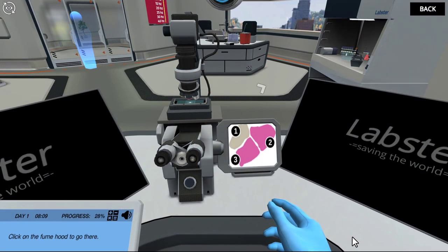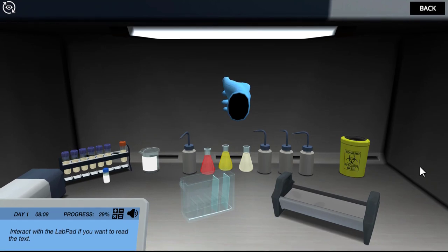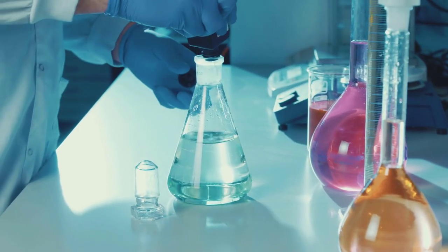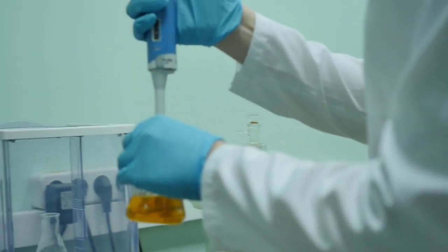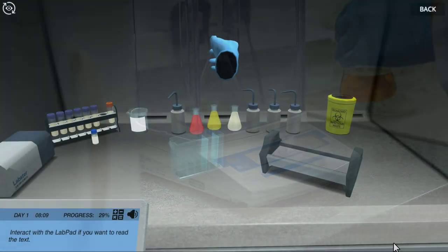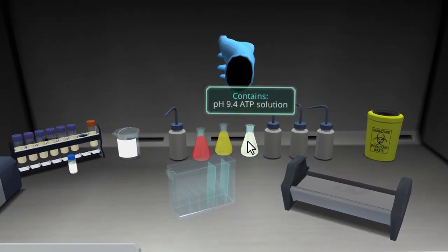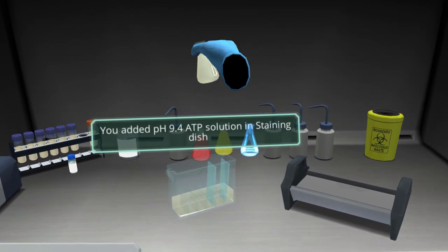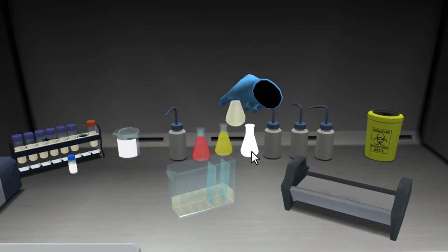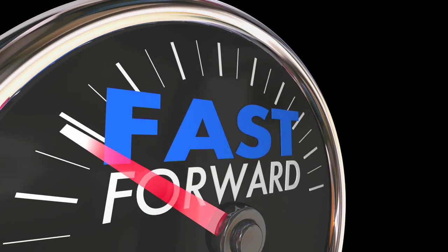Click on the fume hood to go there. The sodium hydroxide has been added to the first solution and is incubating for 15 minutes. The pH of all necessary solutions have been set for you. One thing to keep in mind is that the ammonium sulfide must be yellow. If it turns red with age due to oxidation then it is ruined as a reagent. Time's up. Pour the pH 9.4 ATP onto the slides in the staining dish. This has to incubate for 25 minutes to allow for the formation of phosphate. The slides must then be washed with calcium chloride three times.